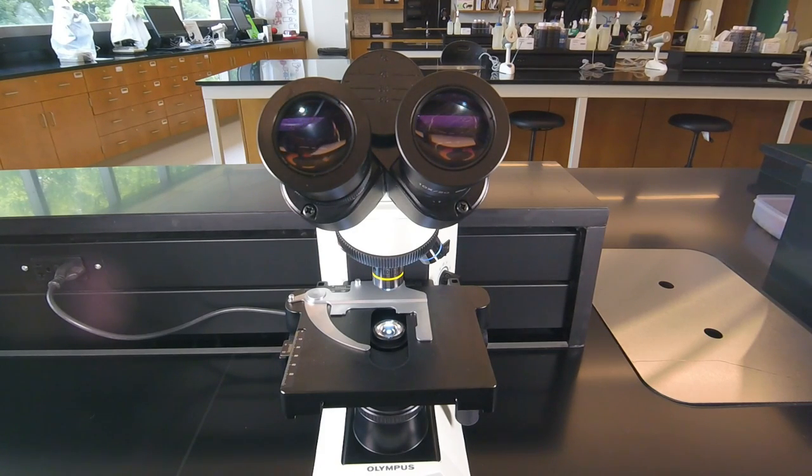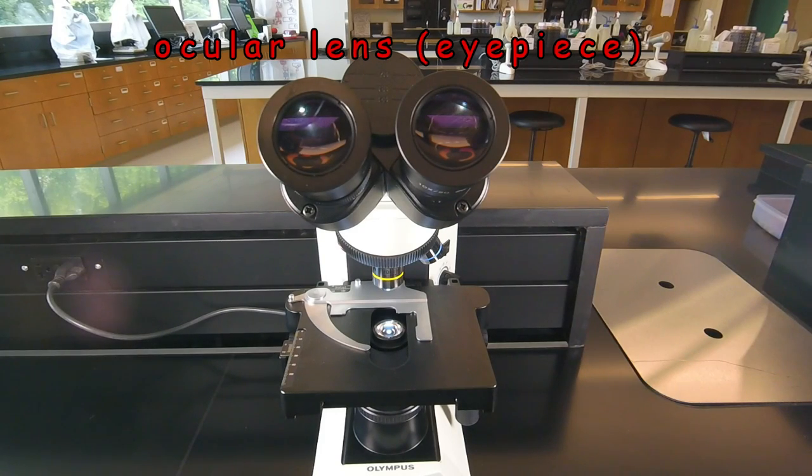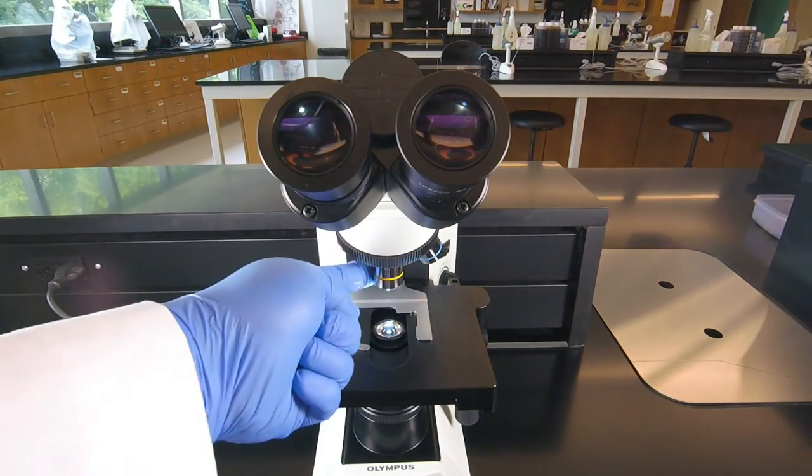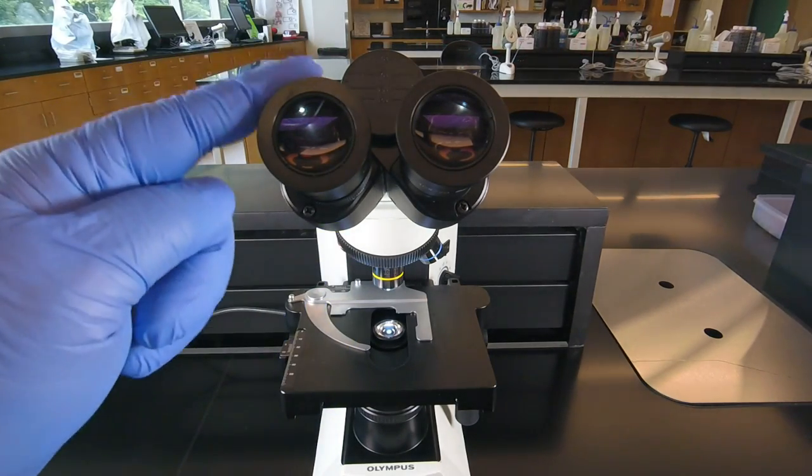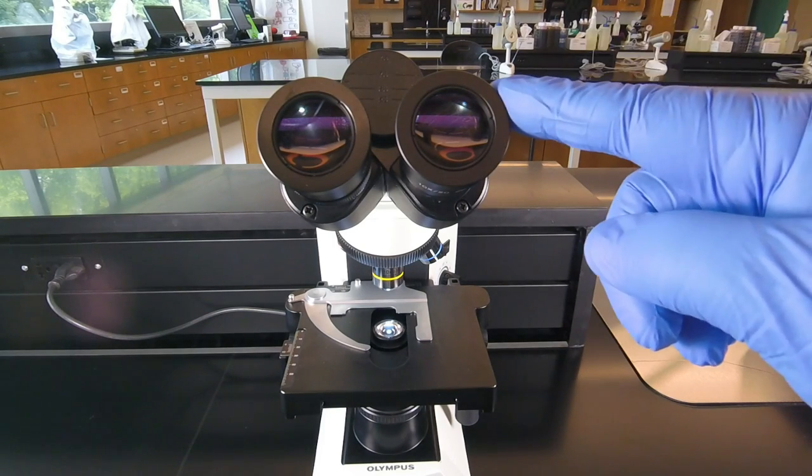Once we have the microscope turned on, we're ready to adjust the eyepieces. These are binocular microscopes, which means they have two oculars or eyepieces. Now we have to make sure that we have some lens clicked into place over the light source. So we'll see some light coming through here when we look through the eyepieces. You're going to want your eyes about three quarters of an inch away from the eyepiece.